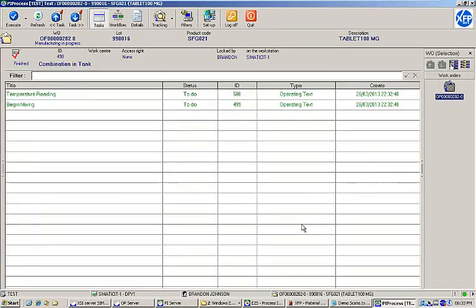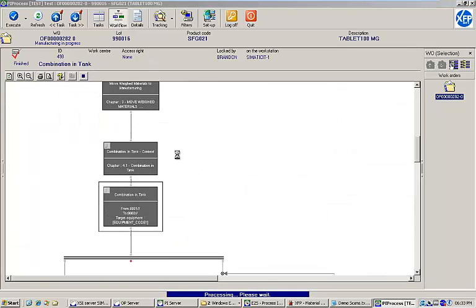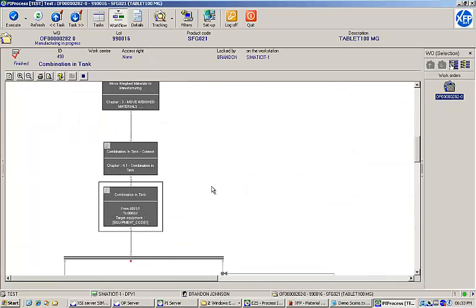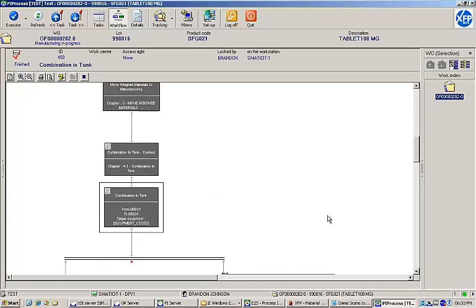At this point, we have two parallel tasks available in our task list. We can either perform a temperature reading or begin mixing. If we look at the workflow view, we can see that both tasks are active.